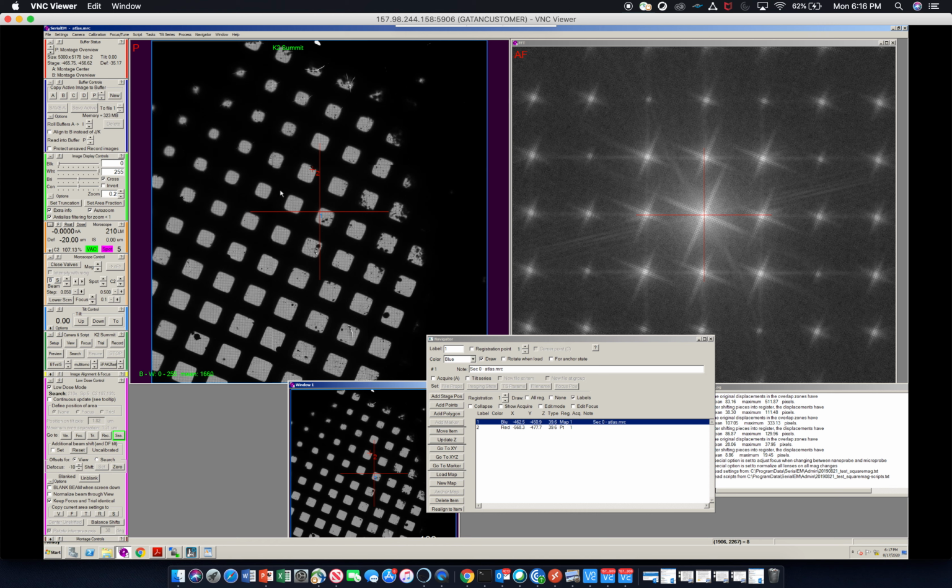But just looking at this atlas, one thing you'll notice is we have thick ice here, and then we have very open grid squares here. And almost always these types of grid squares will have empty holes or ice that's too thin, whereas these types of grid squares, the smaller ones, will have ice that's too thick. So you kind of want to hit the Goldilocks zone when you're picking these, and pick something more along the lines of these grid squares where my mouse is, that have rounded edges and are kind of medium sized.